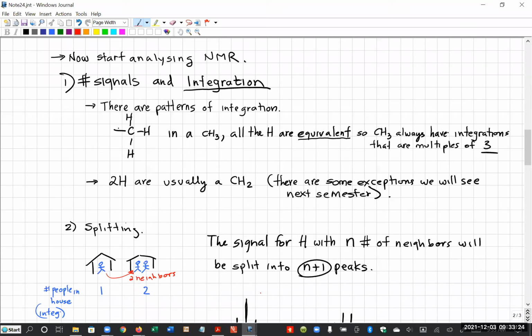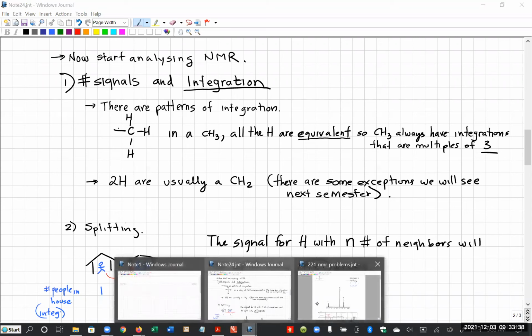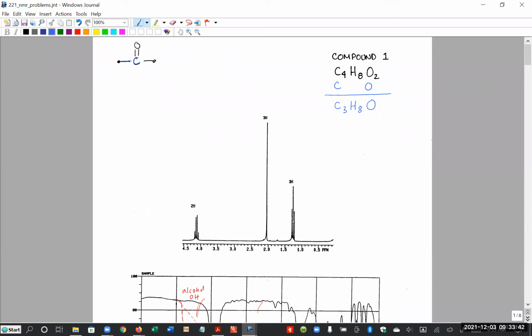So when you have equivalent hydrogens, each of those hydrogens will absorb some portion of the radio energy we put in. And so the total amount of energy absorbed will add up. And that will appear in the NMR spectrum as an increase in the area of the peak. Now, these NMR spectra were made on a very strong instrument, an instrument with a very large magnet. And the stronger the instrument, the narrower the peaks become. And it can be a little hard to see the areas under here. But these really powerful instruments have computers to analyze and present the data to us. And the computers can work out the area.